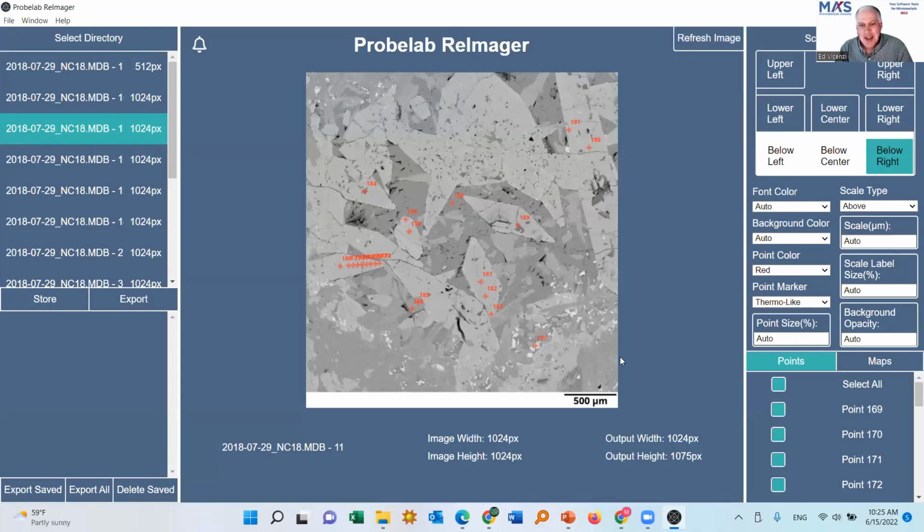Yeah. Thank you, Annette. I can see that Reimager is going to be very useful, particularly if you were generating an image atlas among other routine images. Yeah. Or you just very quickly want to create documentation or even see what's in the files.